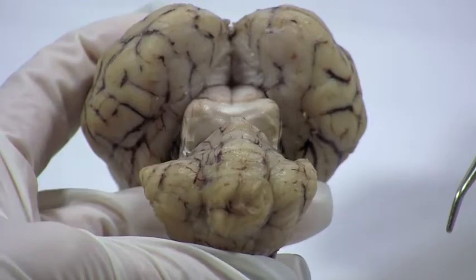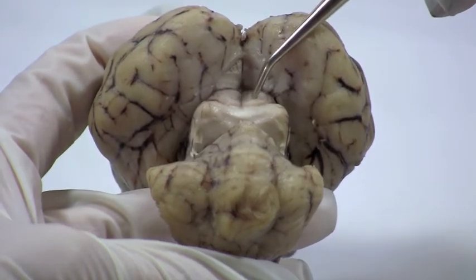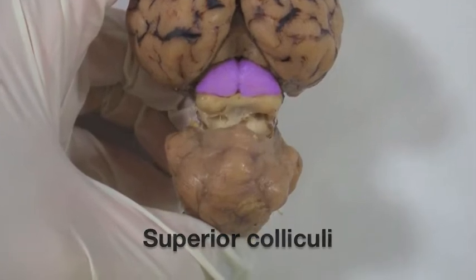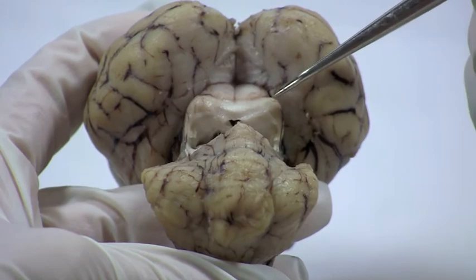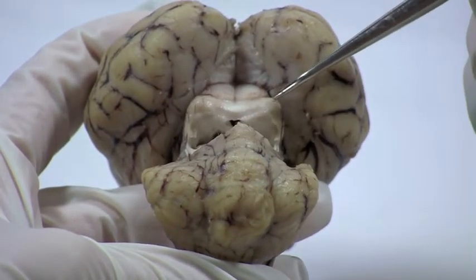The corpora quadrigemina is made up of the two superior colliculi, which are visual reflex centers, and the two inferior colliculi that relay auditory information to the sensory cortex and are involved in reflexive responses to sound.